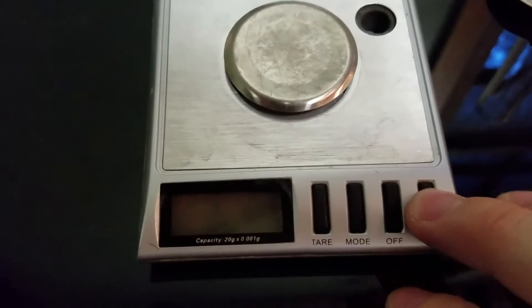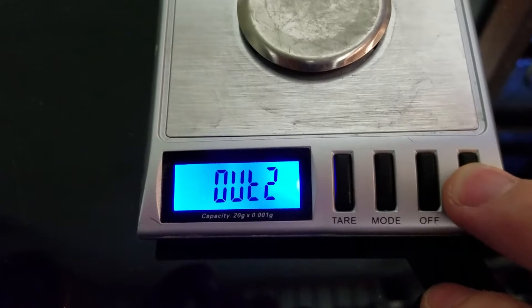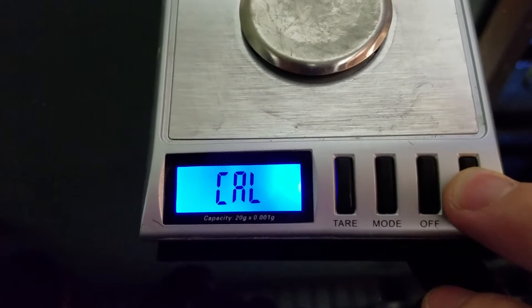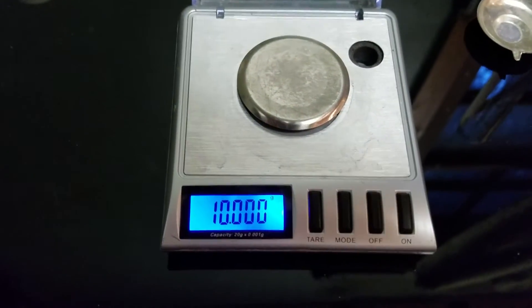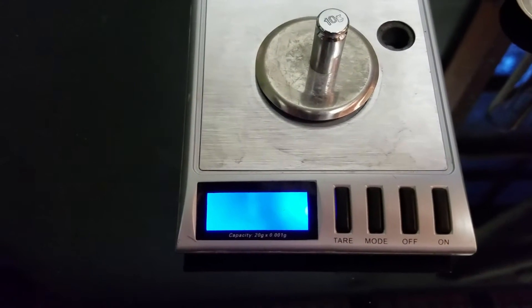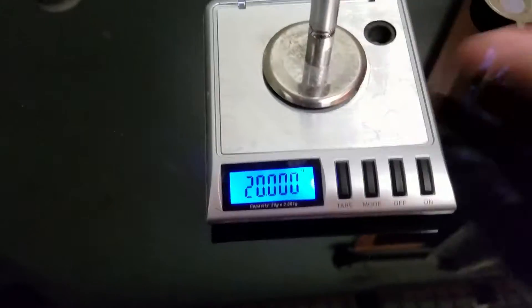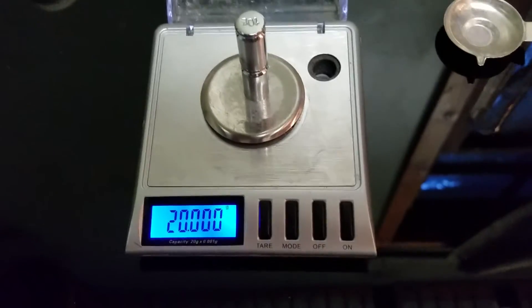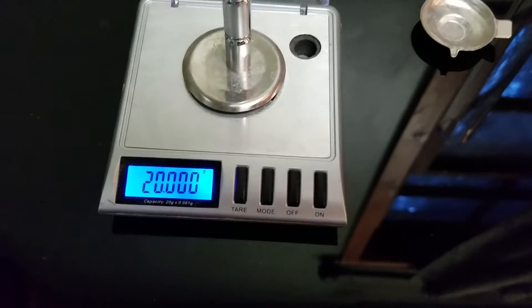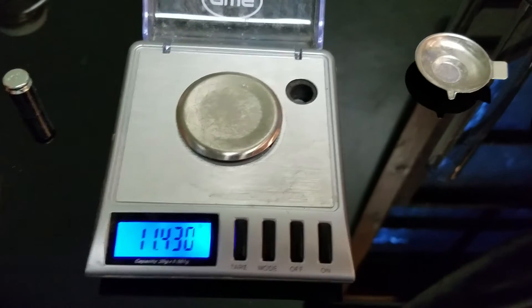It's not even functioning — neither of them. Calibration. Let's get our 10 gram weight. Now it's reading 20 grams. So it wants me to add one more to ensure the calibration process, and it passed. According to the scale, it is ready to go. We're reading 20 grams, which is accurate — two 10 gram weights. Let's take them off, turn off the scale, and turn it back on.